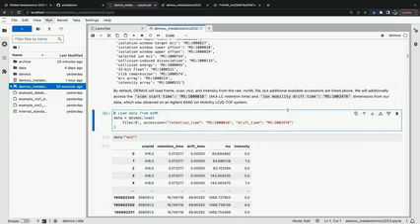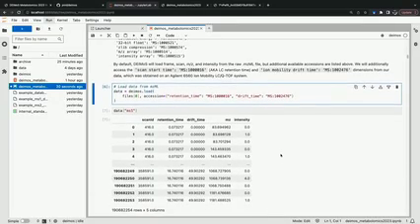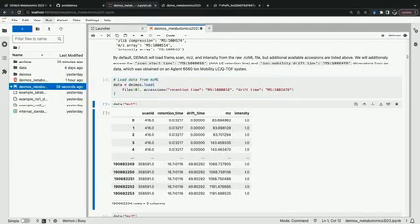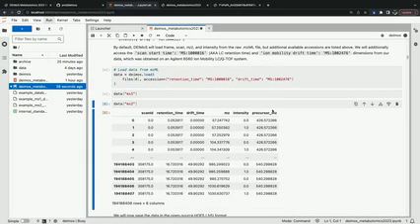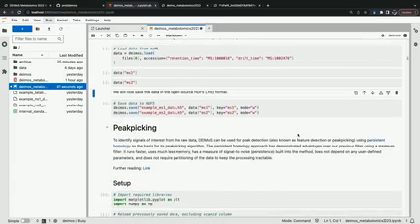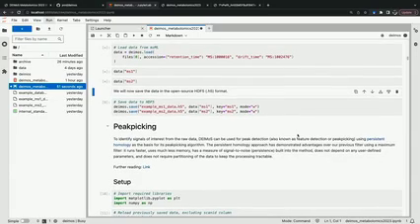And so to load that data, we'll grab that file and specify those accessions that we want here. And so I'll just load this data file here. The data will contain both MS1 and MS2 data. And so I guess I'll just wait a second for this to load.